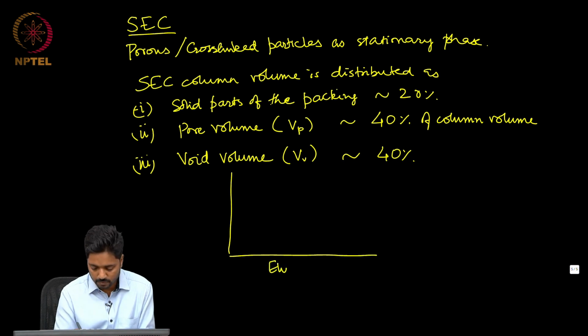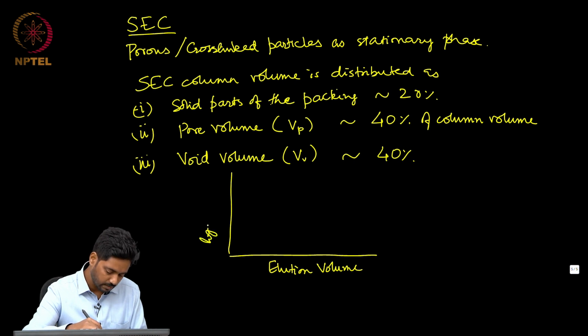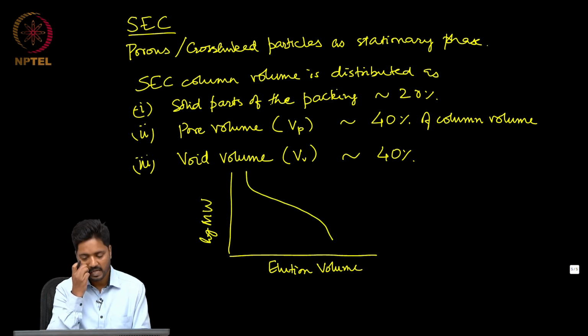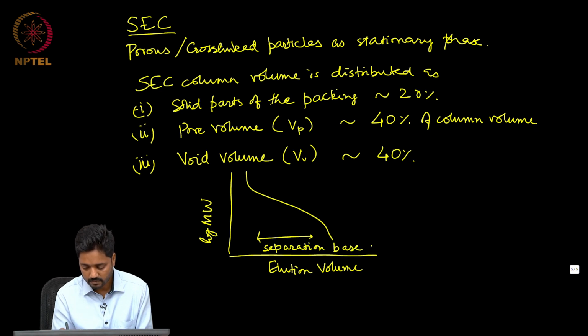When people plotted the elution volume versus the log of molecular weight of the polymer, they observed a profile which looks something like this, and it is this regime which is of interest to us, where actual separation based on size is happening.